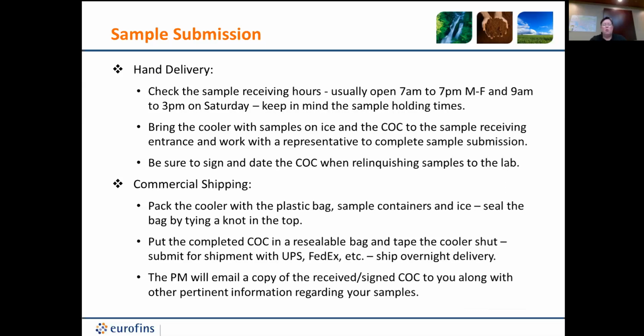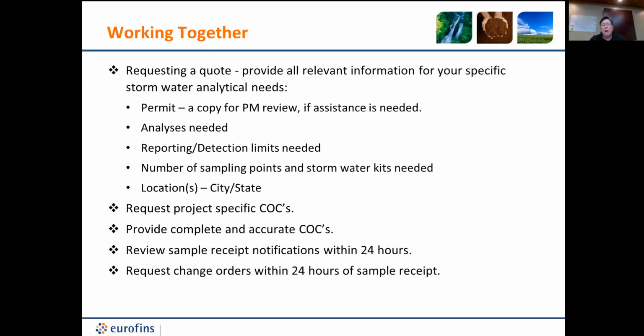Here, please look this over. This is telling you what we think we need to be doing based on your chain of custody. Give us approval to proceed, or if there's changes needed, please let us know what those changes are. So that's kind of important for us.